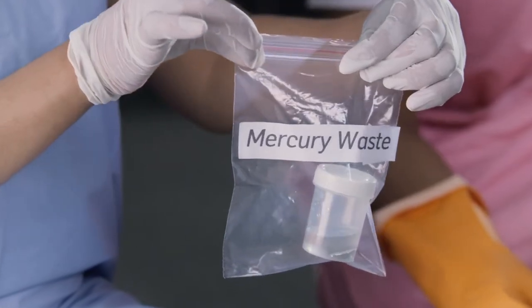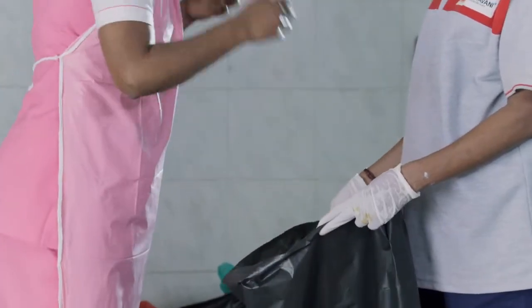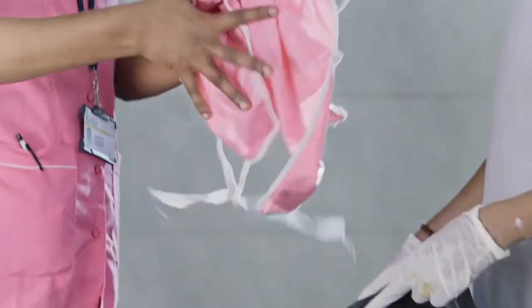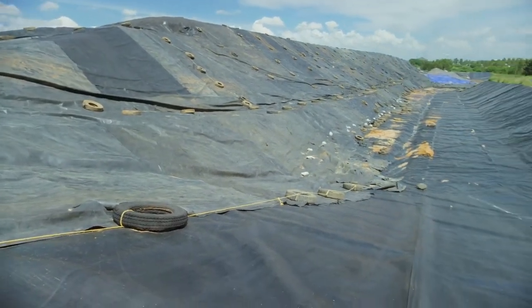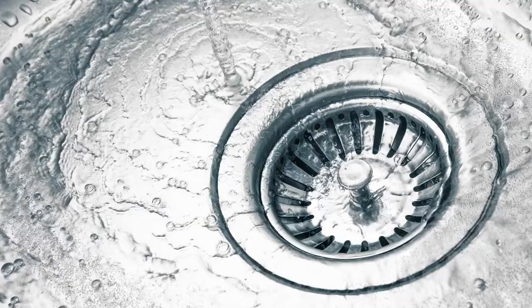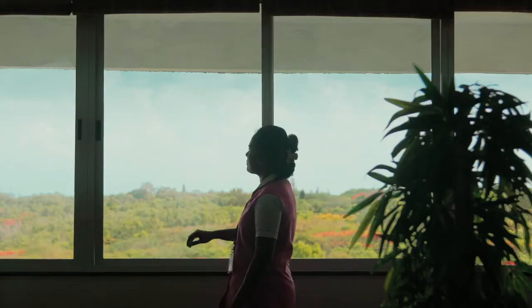Place all materials used during the cleanup into a leak-proof plastic bag and send this to the hazardous waste treatment, storage, and disposal facility. Do not discharge any mercury into the drain or sewer.